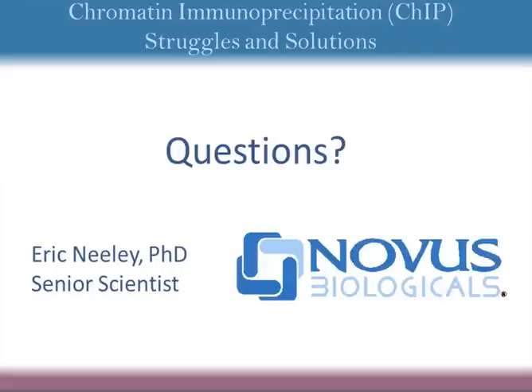And like I said, if it works for IP for you, if you need to test it and it works in IP, then there's a really good chance that it's going to work well for you in ChIP.